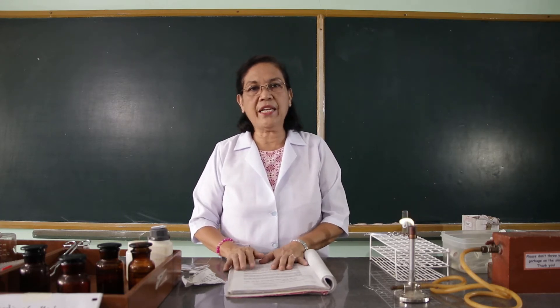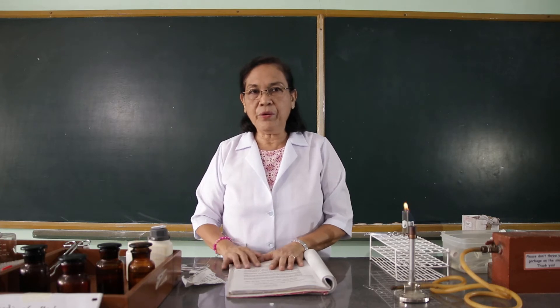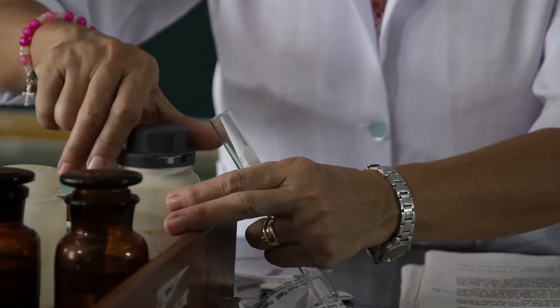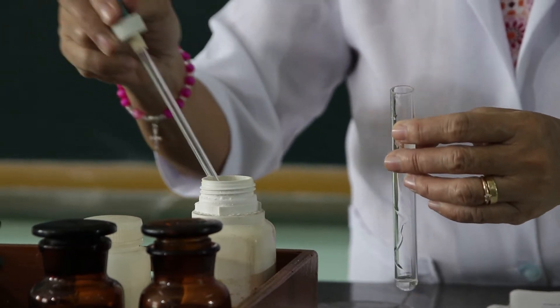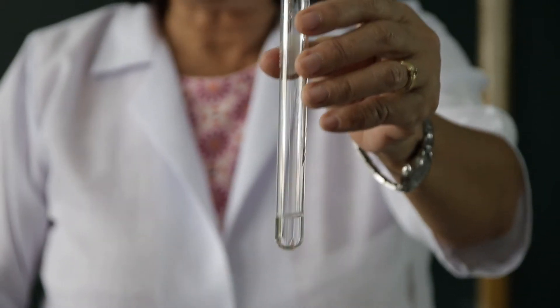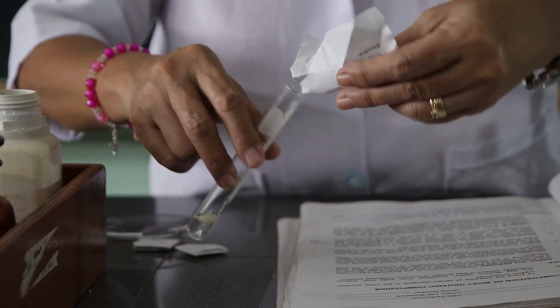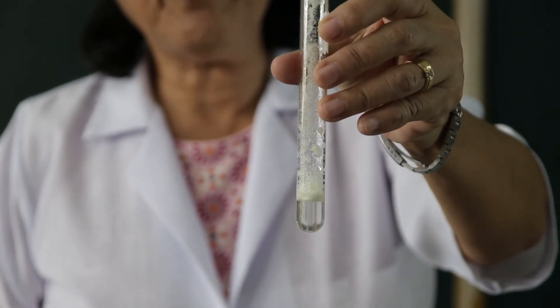The next procedure for this activity or experiment is test for the presence of sulfur. We are going to add a small amount of egg albumin to sodium hydroxide and we are going to heat it for a few minutes. And after heating, we are going to cool the mixture and add some drops of lead acetate. This is sodium hydroxide and we are going to add into this a small amount of egg albumin. So this is the mixture of the egg albumin and the sodium hydroxide.